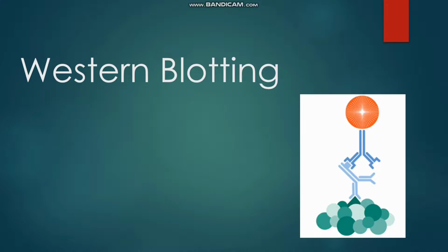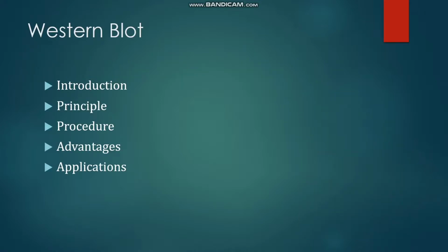In this video, we are going to learn about Western blotting. Western blotting is specifically used for protein. In this video, we are going to learn about introduction, principle, procedure, advantages and disadvantages of Western blotting and applications.